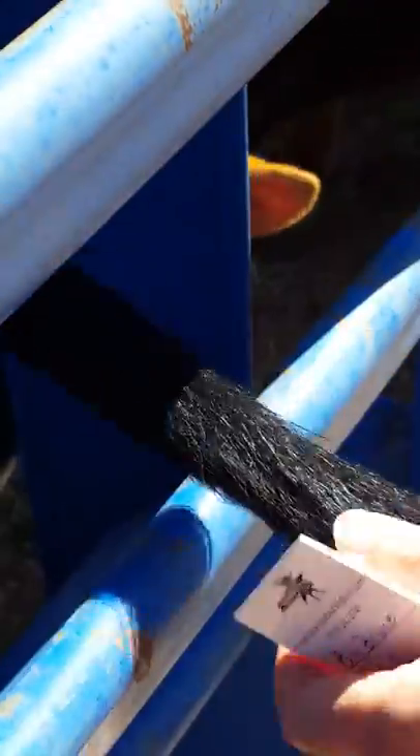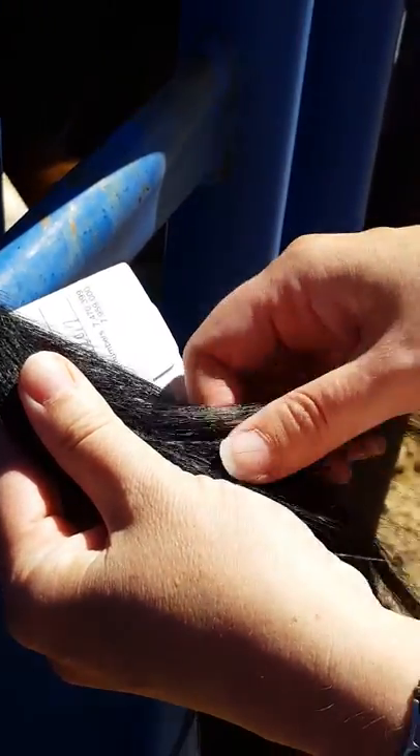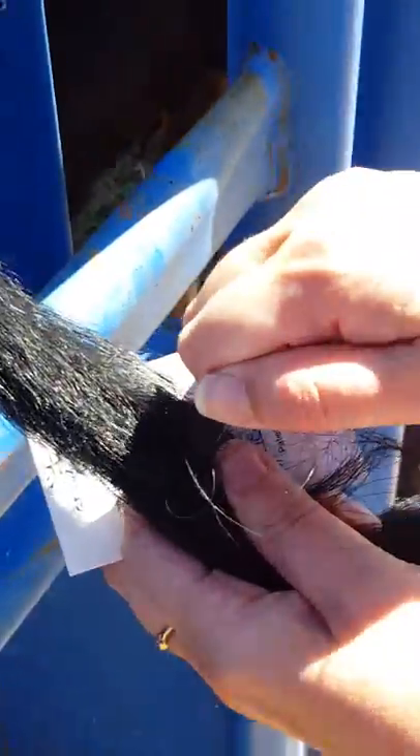So at this point, you want to take the switch of the tail and you want to get about 10 to 15 tail hairs. You wrap it around your finger and pull.